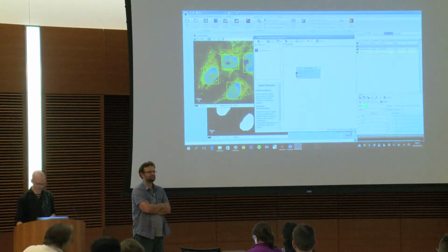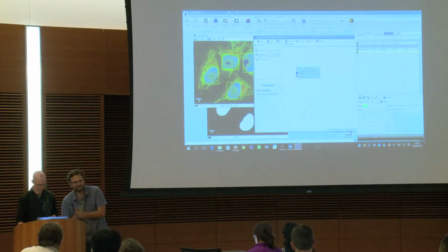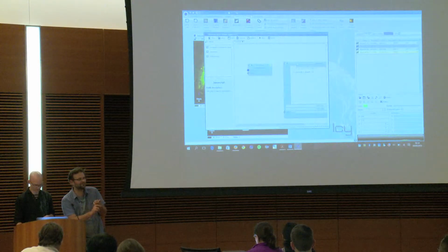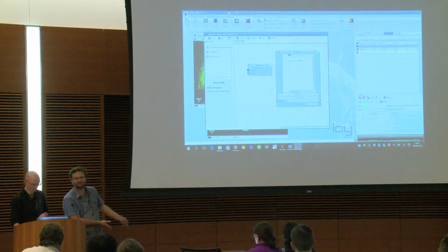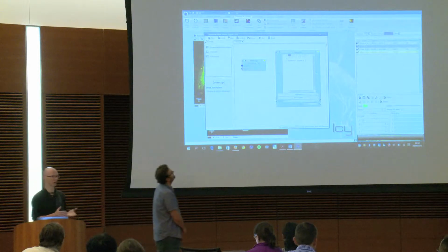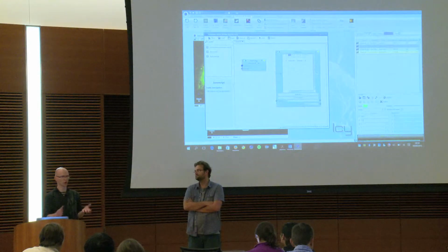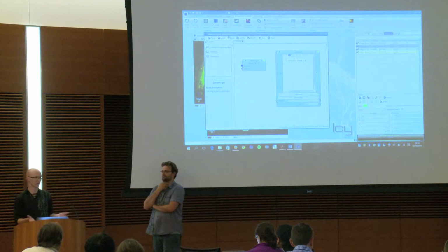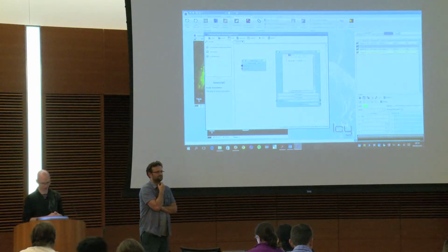You have a script block. If you keep the script, that's why for the last 10 minutes, I would like to show you very quickly the script editor, the bug reporter, and how to process with ImageJ, because we didn't see it. But actually, the JavaScript block is very important because you don't have a block for everything. Sometimes you will get stuck because you don't have a block which can do exactly what you want. In this case, you can use the JavaScript block and do whatever you want, because JavaScript gives access to almost everything. So it's very important to know that you have this possibility.